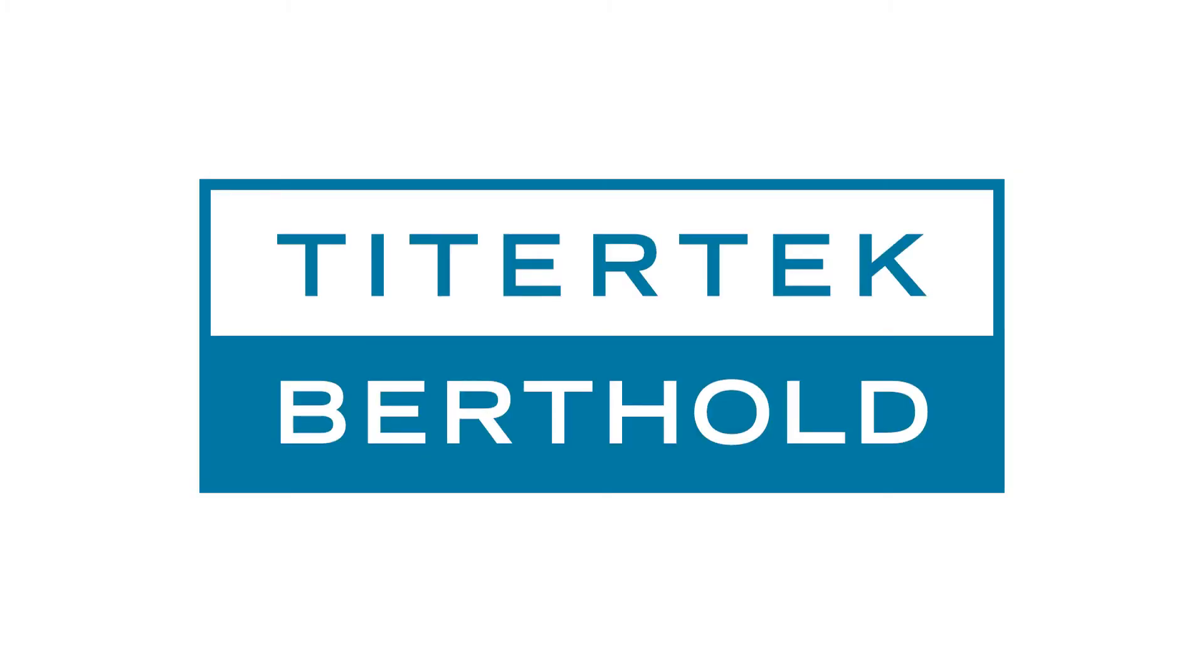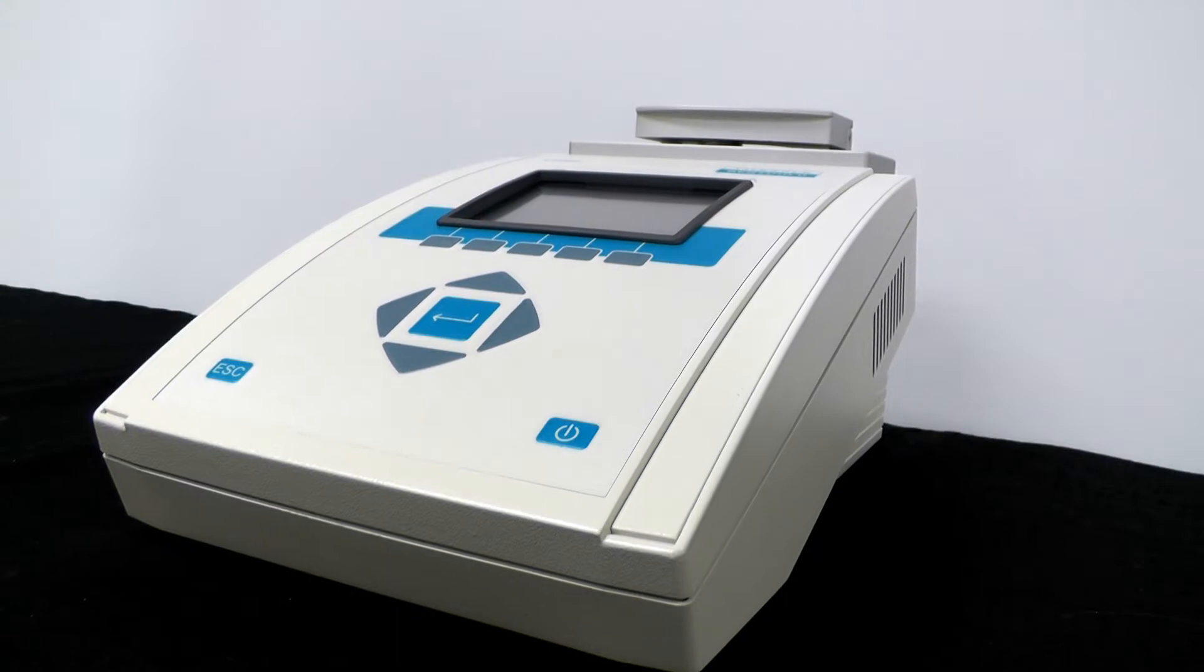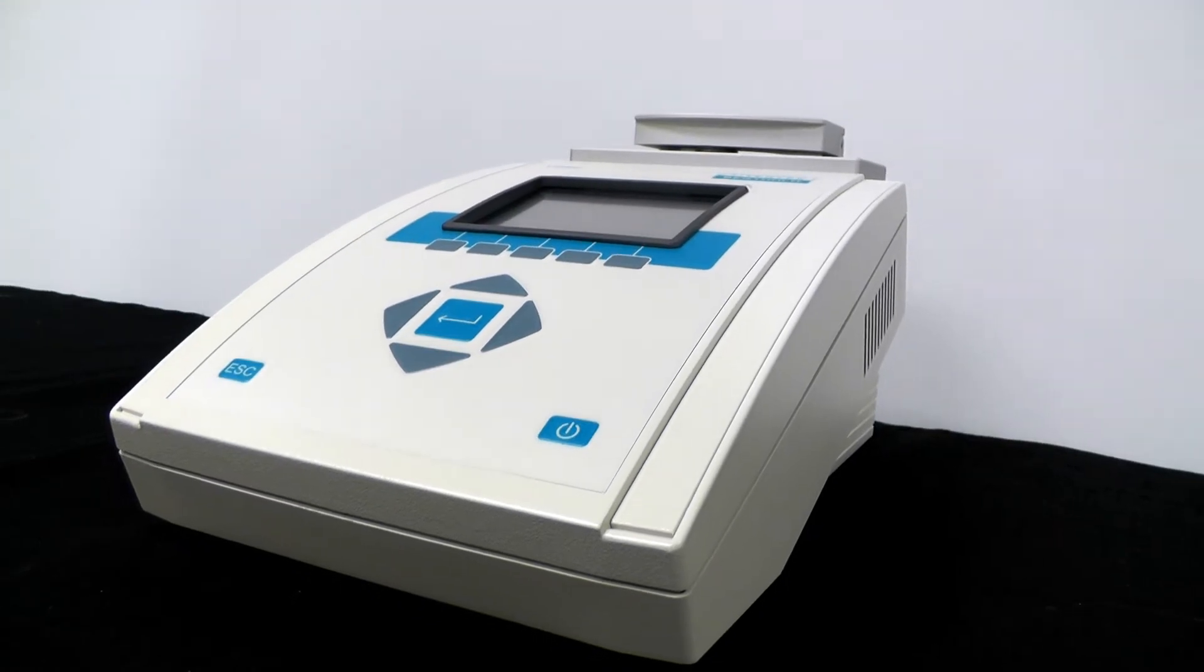Welcome to Titertek Berthold. This is the new Colibri microvolume spectrophotometer for the measurement of DNA, RNA, proteins, and more.